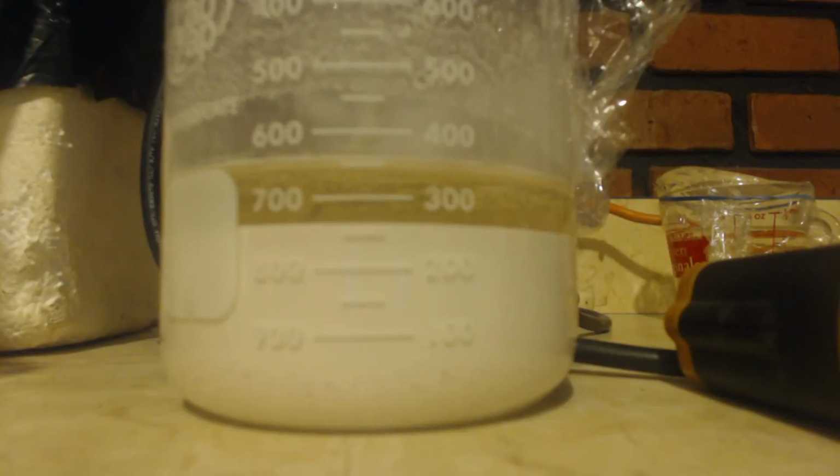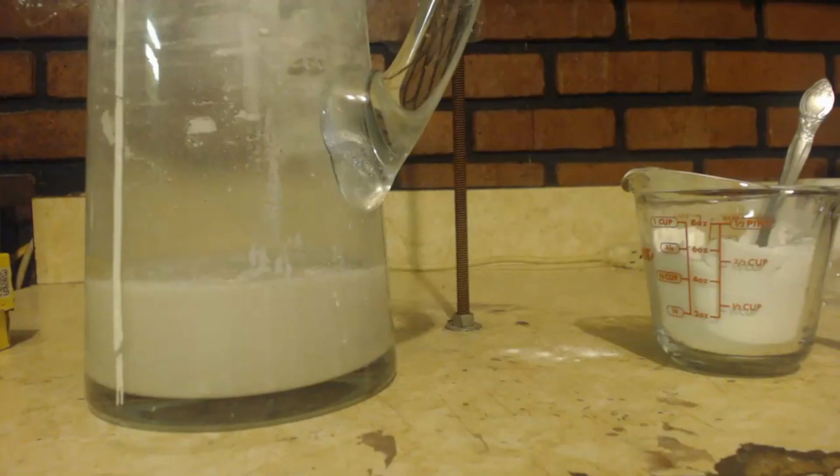Now keep in mind, I'm taking this to a pH of 7, and then when I change it into sodium ethyl sulfate, I will take the pH up to 14. Now, the way you're supposed to do it really is to probably take the pH up to 10 right now.